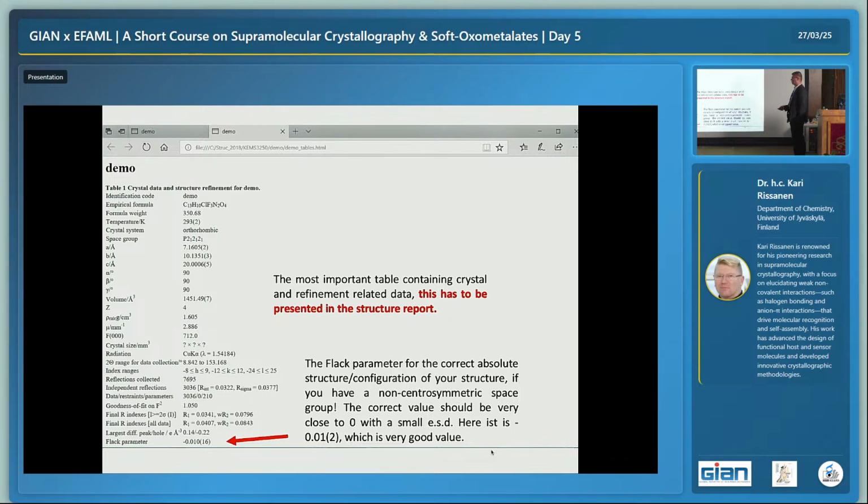And this indicates that we have a reasonable amount. It's not a very big structure, only 210 parameters. Point to look for the mathematical calculations, what it's doing. It is using all these 210 parameters, each of these reflections. So it's a huge calculation.